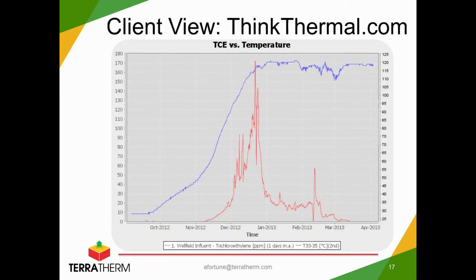For this particular site, we also had all of our FTIR data going through the thinkthermal.com website. So real time, anyone from the project team who had access to the thinkthermal.com website for this particular job site could access the FTIR data as well as other data, temperature data, and other related data to see what was happening on a real-time basis.